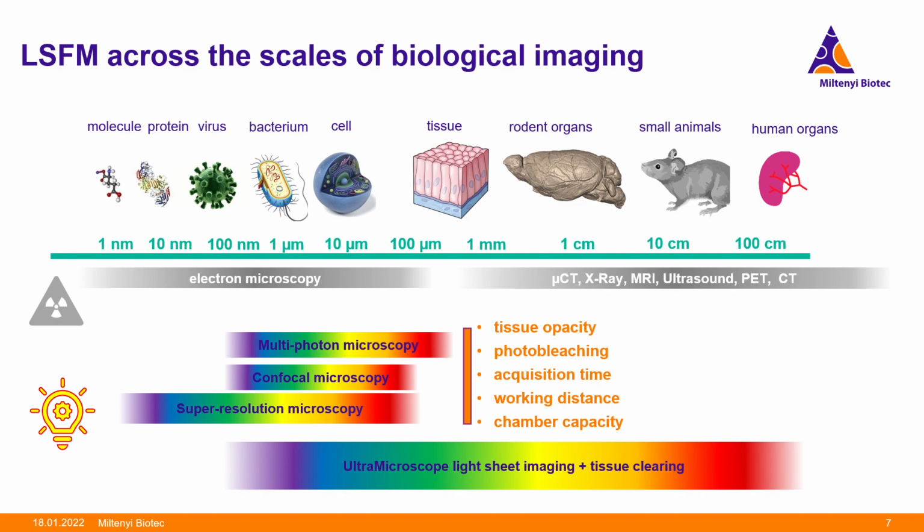Thus, when combined with tissue clearing, light sheet microscopy allows the imaging of a large range of sample sizes. If we look at the graph here of the range of all the biological samples that you may be interested in looking at, not only are we able to image, say on the left side here, those smaller samples such as Drosophila brains and organoids, in which you probably may have already used confocal workflows and have gotten great results with.